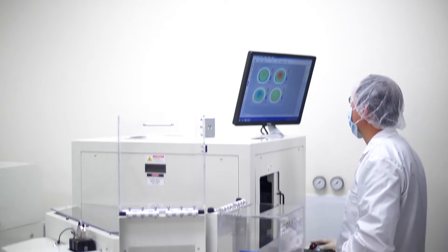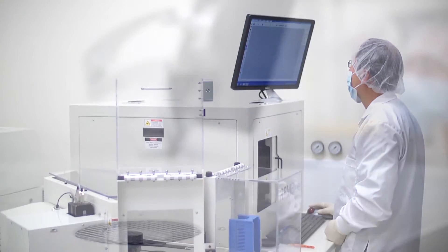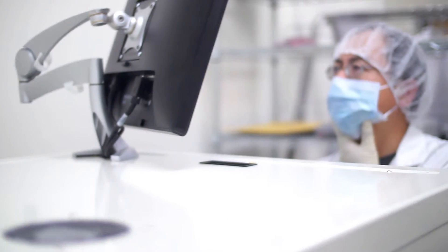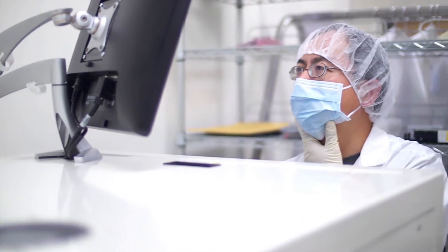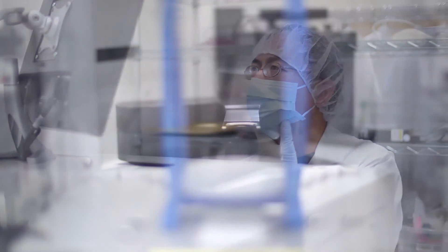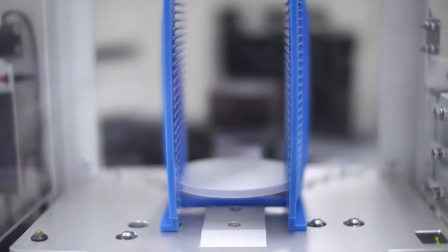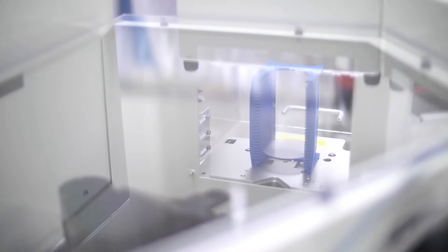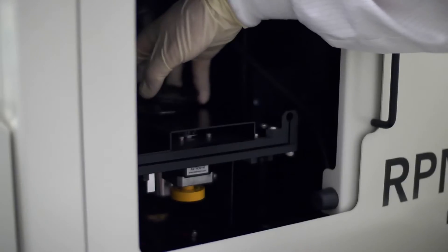Thanks to the large portfolio of laser sources, gratings, and array detectors, the RPM Blue FS can be configured for automated production control while also having the ability of manual loading wafer pieces or small samples for R&D purposes.